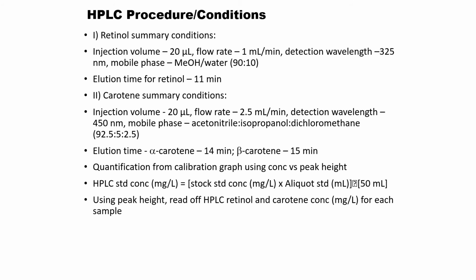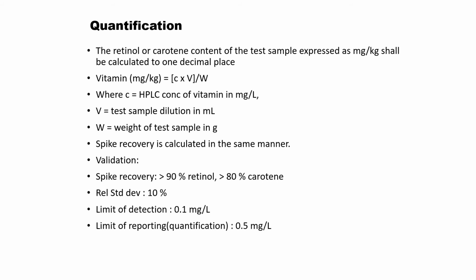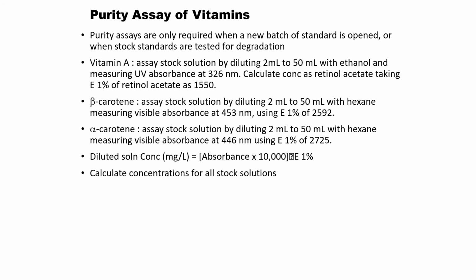So the HPLC conditions are written here: the injection volume, the elution time, which is about 15 minutes, and the quantification method. What method do they use? The formula to calculate the vitamin concentration, limit of detection 0.1, quantification 0.5.